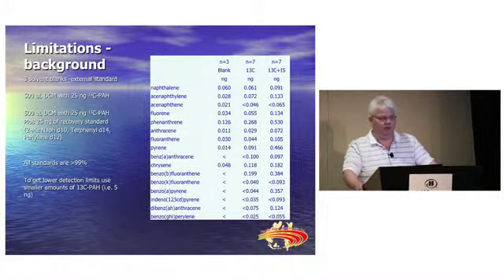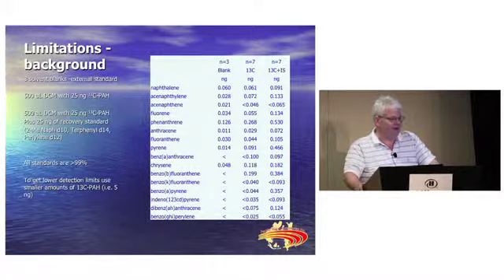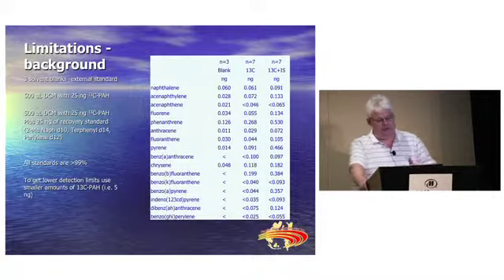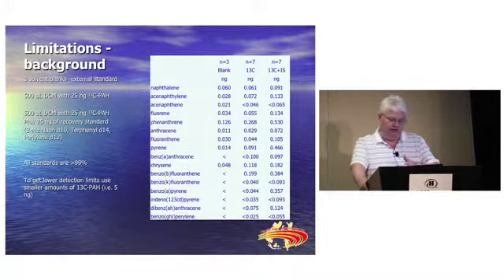Now I operate a commercial lab. I don't have the same fume hood and lab apparatus that Andreas showed us earlier today. I wish I did, and I probably could have better blanks in there. But it shows that the material we're seeing, partially we're introducing it ourselves.